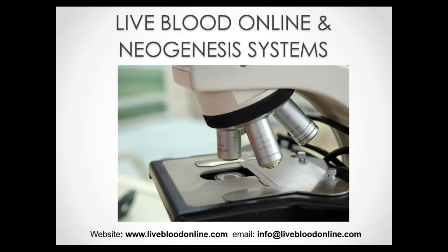Now, I've often seen people who want to add live blood analysis to their practice, but who don't want to invest in a good enough system. So they start with a very basic system that doesn't really allow them to see everything that they should be able to see, and they never really then fully benefit from live blood analysis. So in summary, the theory, the practical proficiency, and the correct equipment are all very crucial to get started.